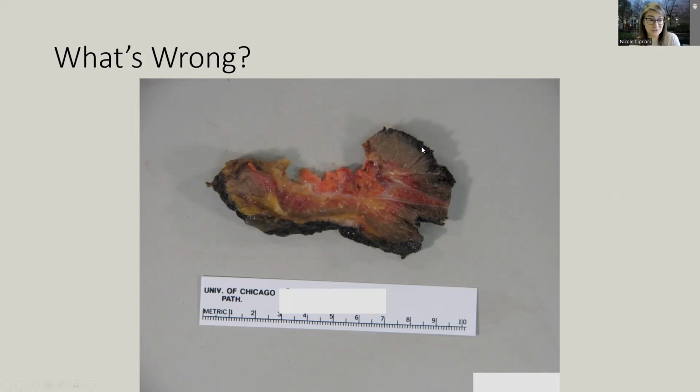So they tried to rectify their initial grossing mistake by eventually cutting all the way through, but we could have done better. We could have cut all the way through to begin with, and had a complete cross section of the tumor and the interface to rib and skeletal muscle, etc. So hopefully they learned from their mistake.